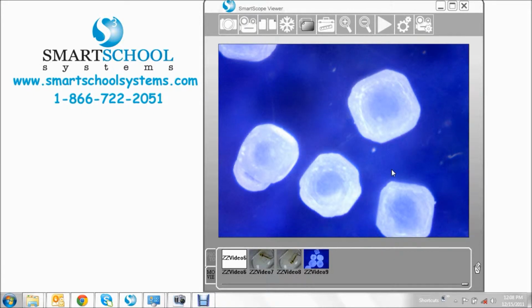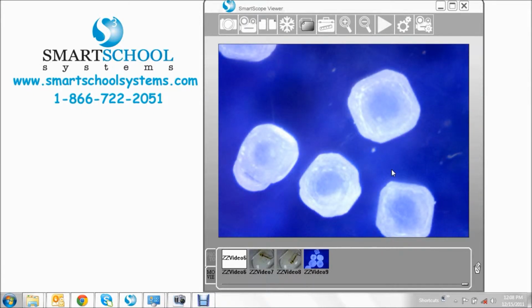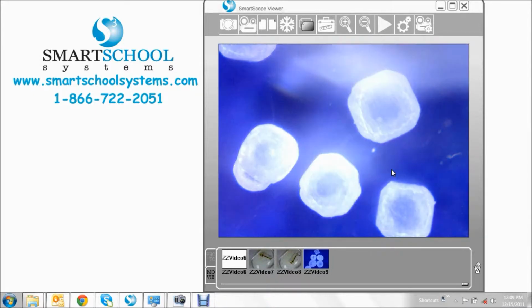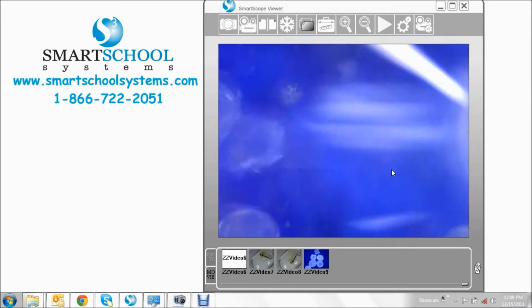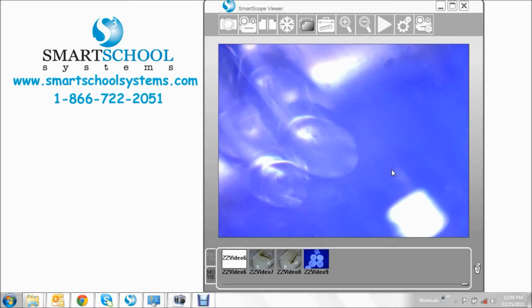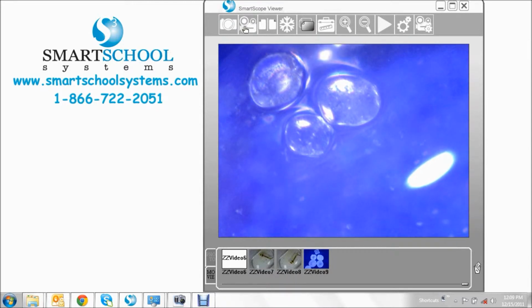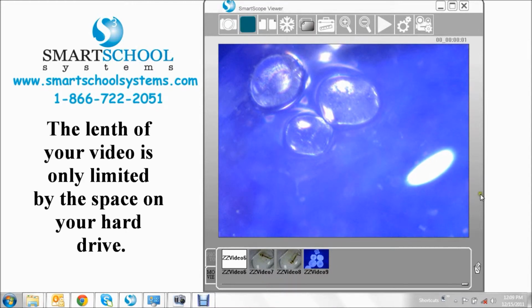Then we're going to come out, and what we're looking at here is just salt. And what I'm going to do is simply put a drop of water on our salt, and I'm going to come in and refocus on our salt, and then click record.